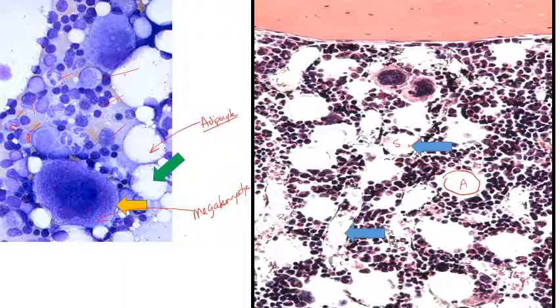How do we know what this is? Is it defined by cells? Well, we kind of see a clear border. That'll probably be a sinusoid. And again, adipocyte. Why don't we see adipocytes? Well, they're washed away with the stain. Whenever we have to fix and stain things, the alcohol that we use actually washes away the adipocyte, and we learn that in microscopy.